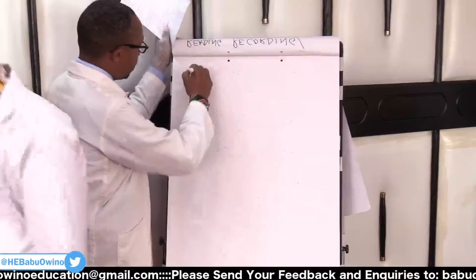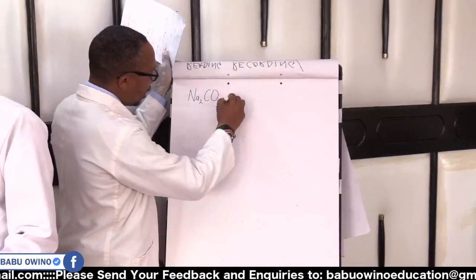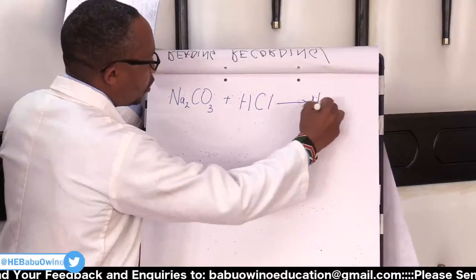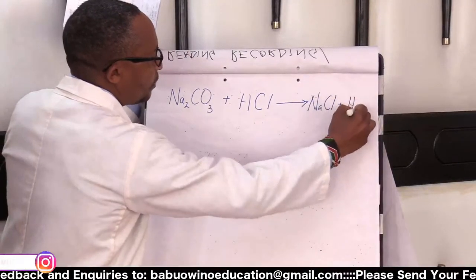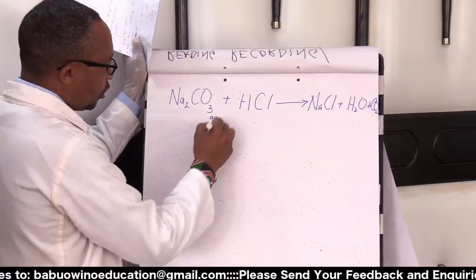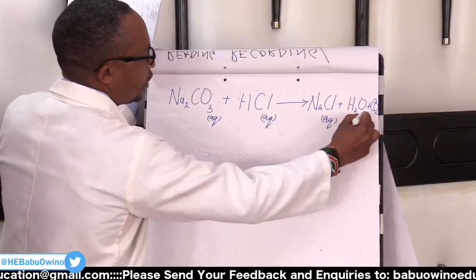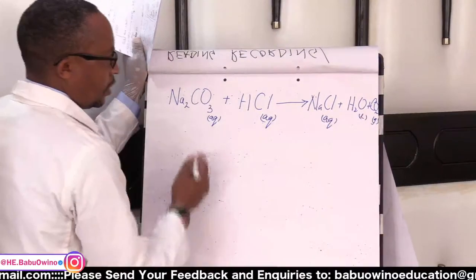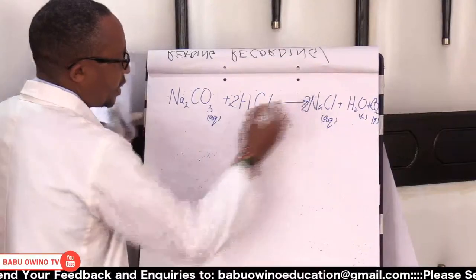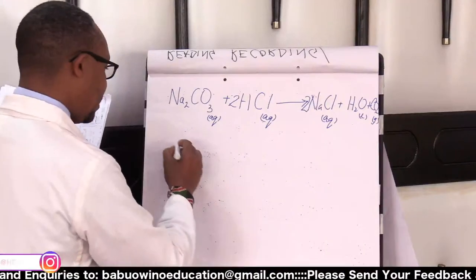What is the interpretation? We have our sodium carbonate. We are combining it with hydrochloric acid. This gives us sodium chloride plus water plus CO2. Then state symbols. This is a solution. This is another solution. This is a solution. This is a liquid, and that is a gas. Then you balance it up. In balancing, we get that. Now from there, we are saying we have our readings.